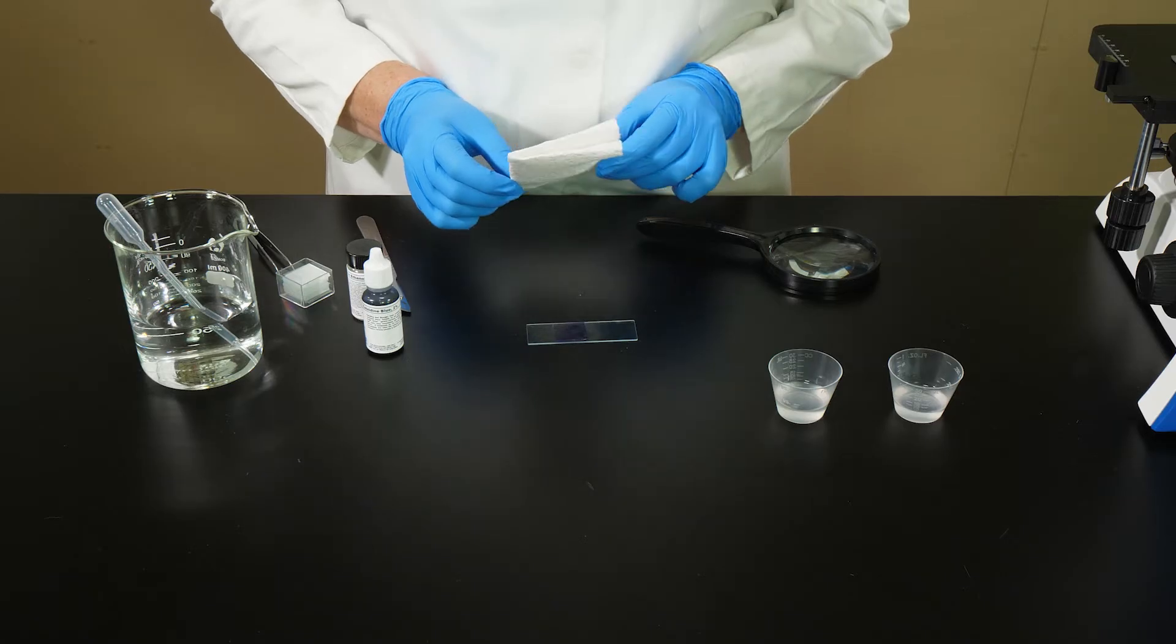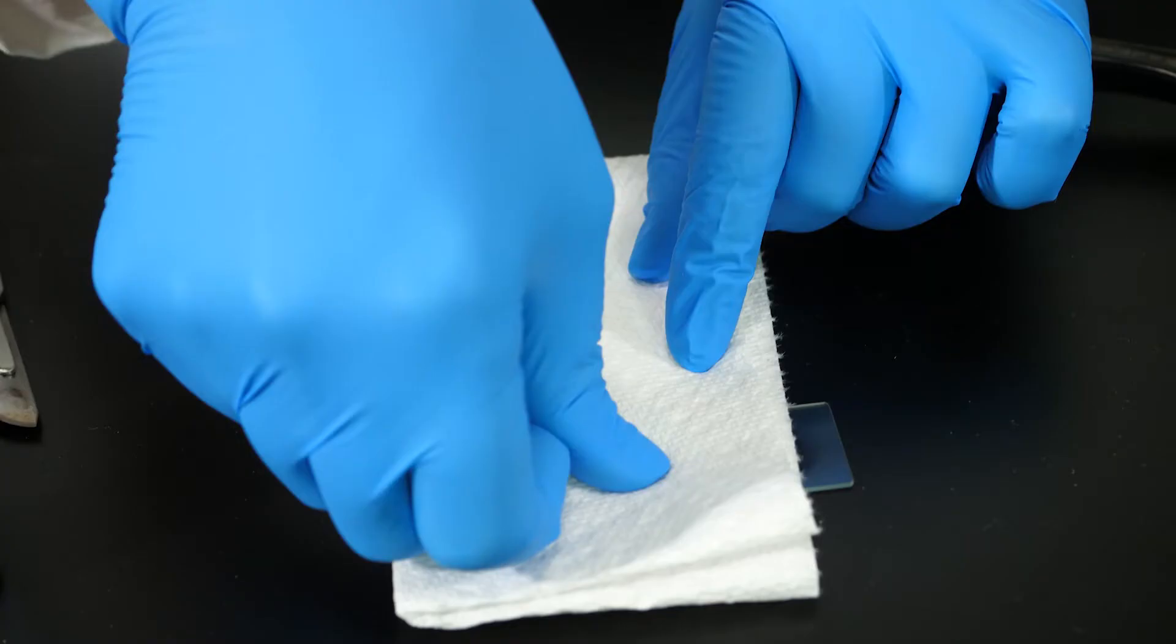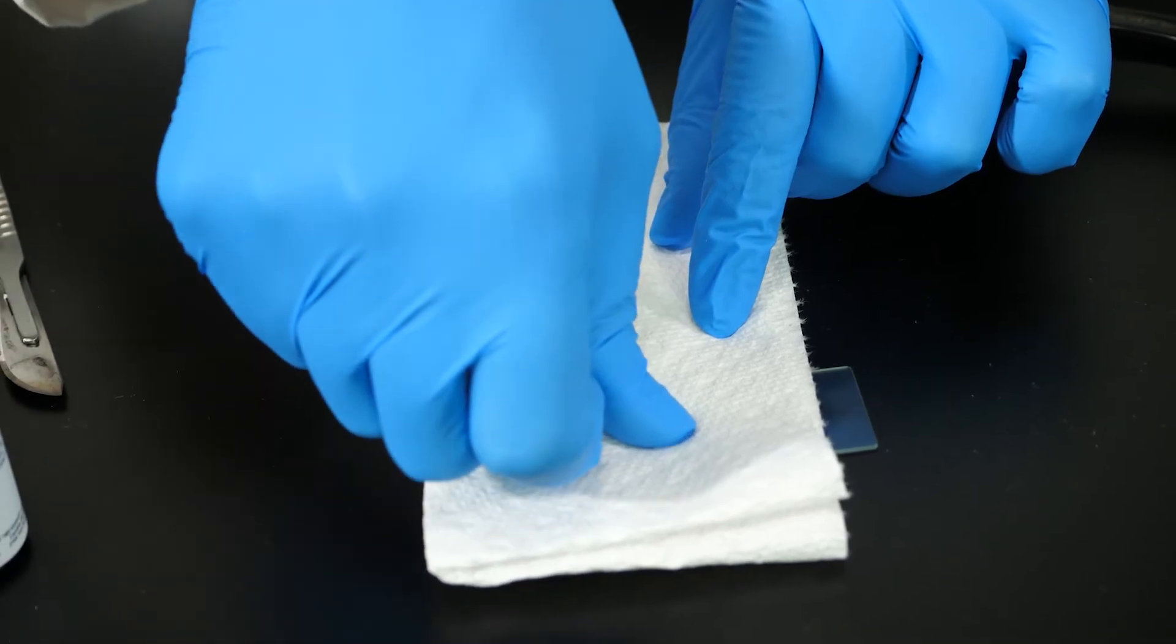The cells of the sample must be in a single layer to allow light to pass through. To make certain the cells are in a single layer, we place a paper towel over the cover slip and then slowly but firmly press down on the cover slip. We must not twist or turn the sample while pressing down on the cover slip, or the cells may be destroyed. And we must not press too hard, or we could crack the cover slip or the microscope slide.